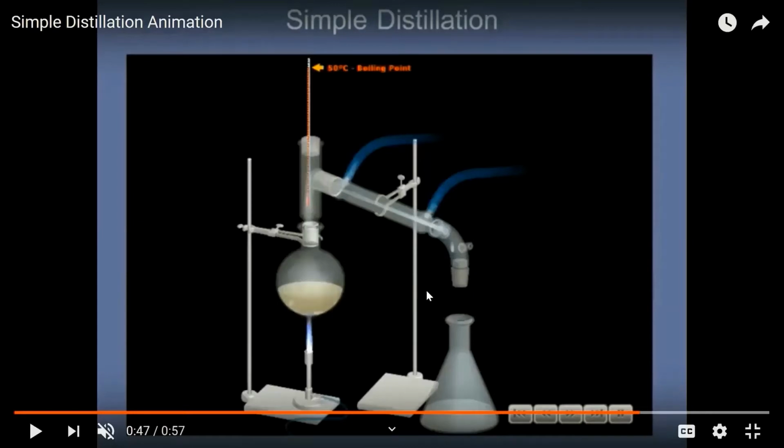You can always pause the video and try to identify the equipment which has been used in this particular experiment, by taking some help from your first video lesson of experimental chemistry. Now let's have a look at the simple distillation process of carbonated drinks shared by the Cambridge International Examination.